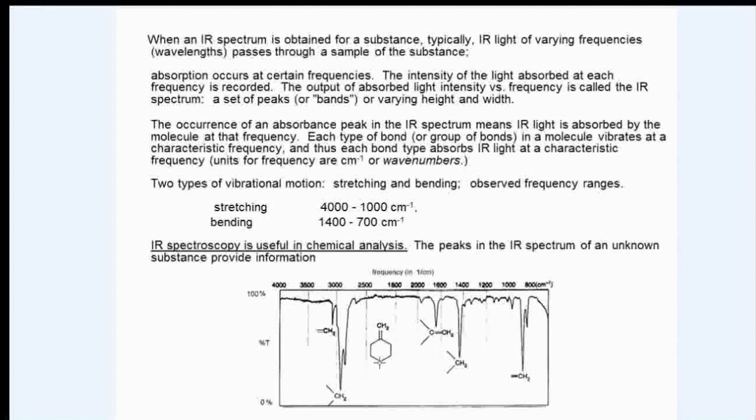We're going to get an IR spectrum for this compound, and what we do is pass a beam of IR radiation through the sample molecules. Now, this IR beam covers a wide range of IR frequencies, from low to high values, and all frequencies in between. In this particular example, all of the vibrations in our molecule meet the criterion of changing polarity during a vibration cycle.